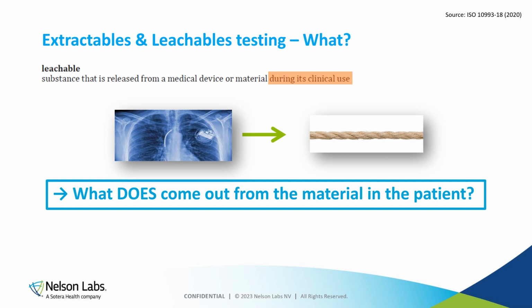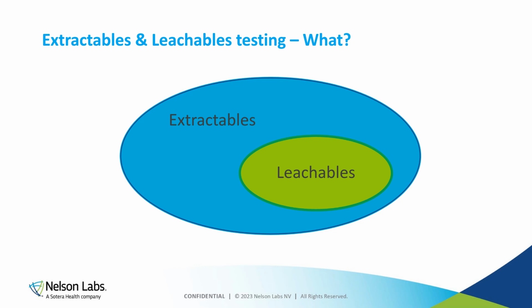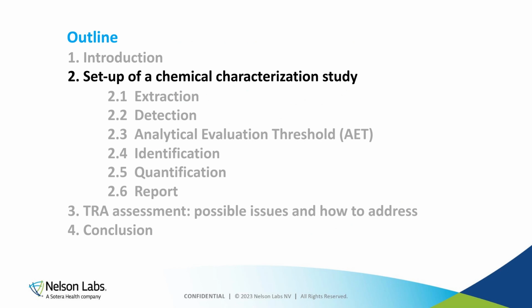Now, however, seeing the use of some medical devices, this is not always feasible. So therefore, here it is better to speak of a simulated use study, where you're going to simulate the clinical use of your medical device as well as possible. And herewith, you always need to keep in mind that your leachables will always be a subset of your extractables.